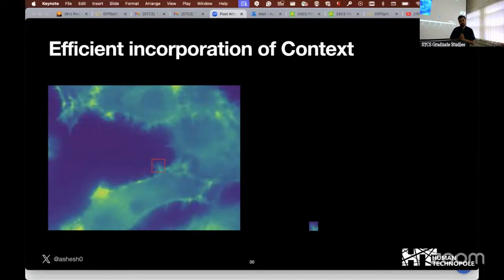I see. So it is not that we are trying to disentangle, let's say, in an unsupervised way, because then you could split arbitrary structure types. This is not what we are doing. We know that we are working to split nucleus from tubulin or some other structure, and we have the paired data for it. So you have a specific type of cell, you know what the nucleus looks like, you know what the tubulin looks like. Yes. This one is separate. Yes. This is more like object identification there.